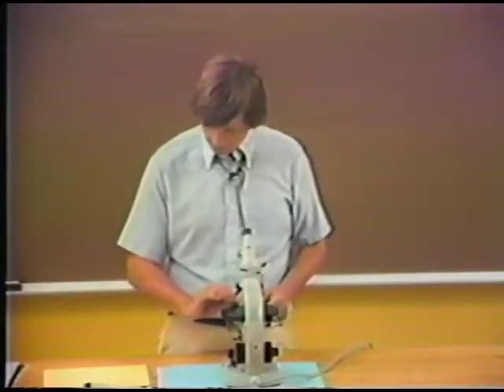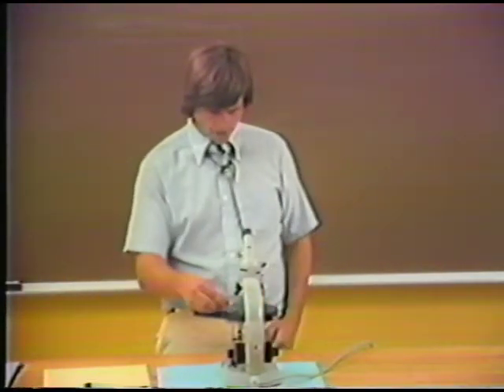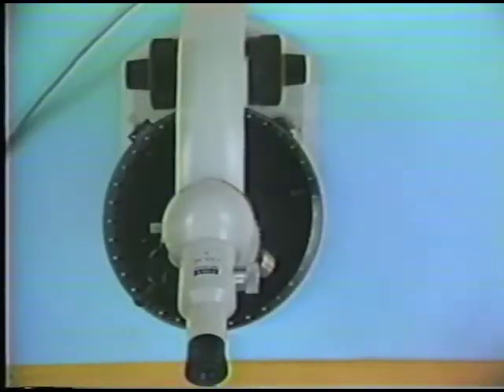Well, another special property can be illustrated in this thin section of granite. This is actually a metamorphosed granite. And this property shows up in the mineral quartz. We're going to look at the quartz grains now, and I'll point out some of these quartz grains in cross-polarized light so that we can observe their extinction.